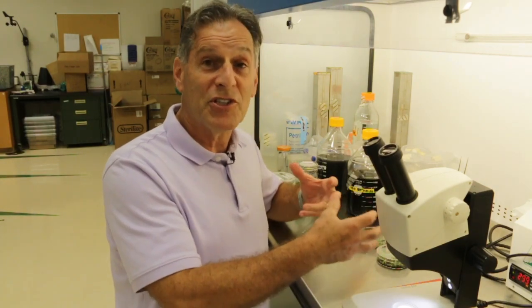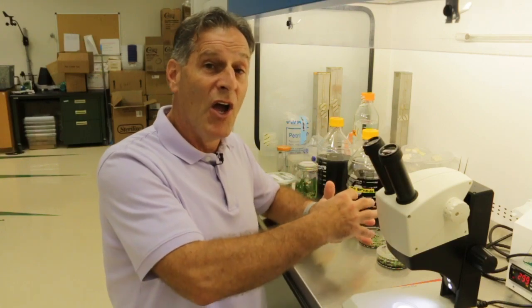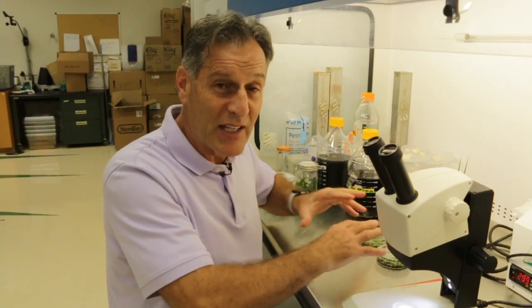It could be that there's still a mix of cells, that there are white cells and green cells in there, and it's giving kind of a lightish greenish or yellowish color. I don't know, but I'm going to try to rescue some of these.